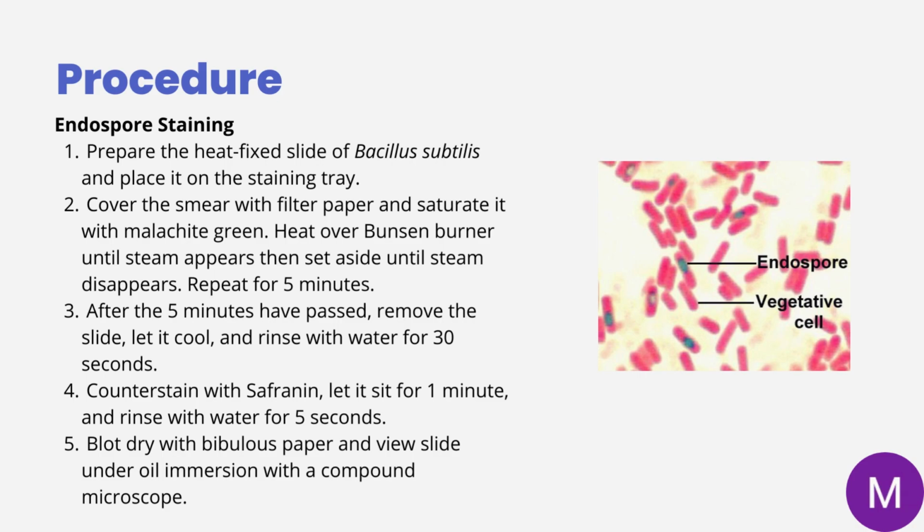We must try to avoid the slide drying out and avoid excess flooding. Then we would remove the slide, let it cool down, and then rinse with water for 30 seconds. Then we would rinse with water for 5 seconds, counterstain with safranin for 1 minute, rinse with water for 5 seconds again, and then we would blot dry with bibulous paper and then examine under oil immersion. What we observe should appear as the image provided in the slide.